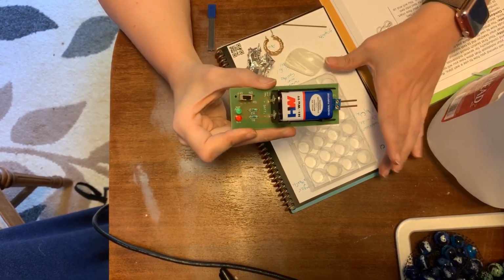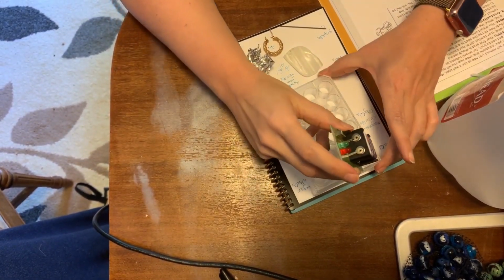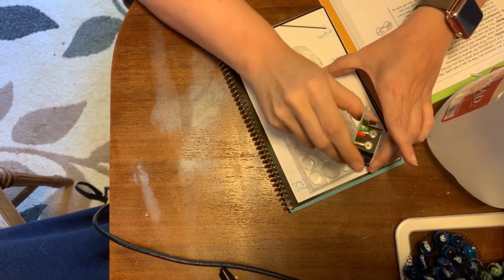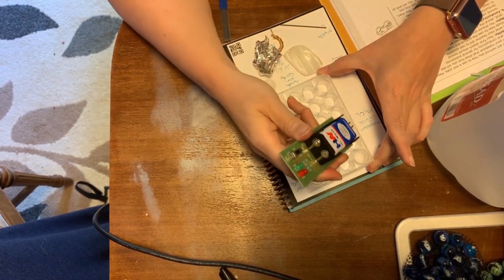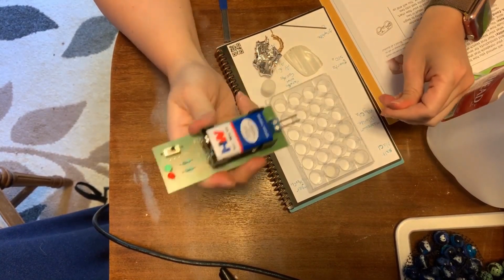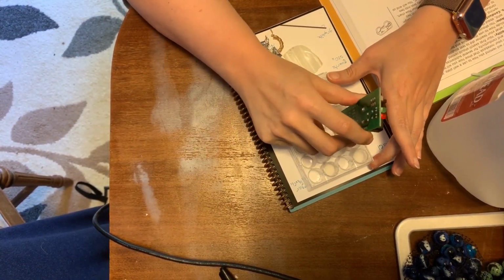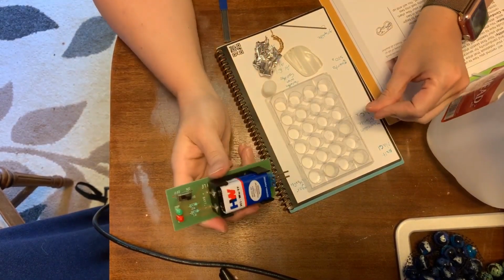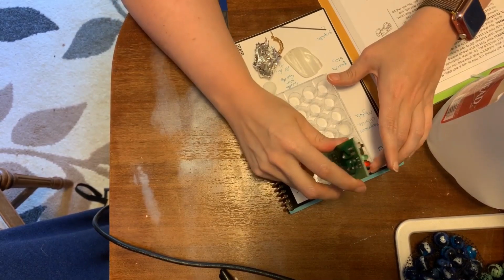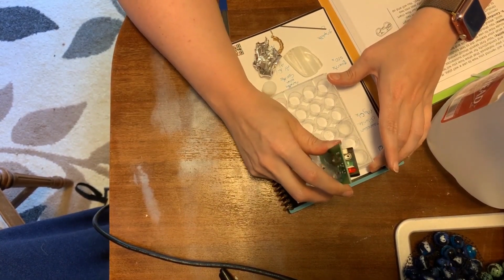Okay. Now I'm going to test my dry substances. So I have salt in this corner up here. So I'm going to stick it into the salt. I'm not getting any lights turning on. Next, I'm going to test the magnesium chloride. Same thing, not getting anything coming through. And next, I'm going to test the sugar dry. And again, nothing came through.